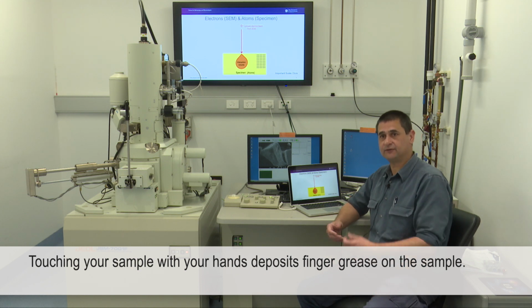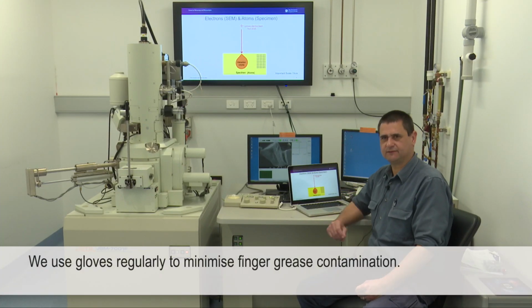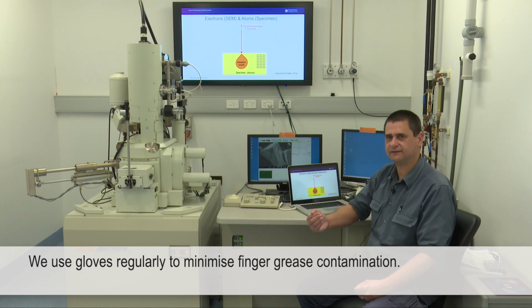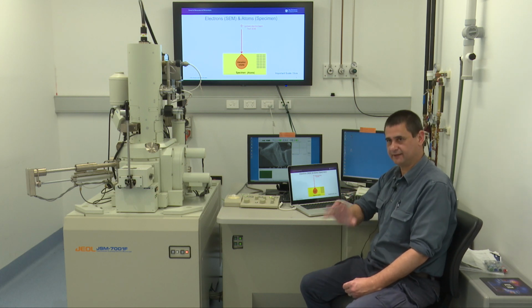We often wear gloves, rinse things in ethanol, but it's also very important to keep your gloves clean. If you've got gloves on and you scratch your hair or use your phone, you've probably contaminated your gloves. So we need to keep the specimen clean. The higher the quality of analysis, the higher the quality of cleanliness of a specimen I expect from you. But electrons and atoms, that's our fundamental.